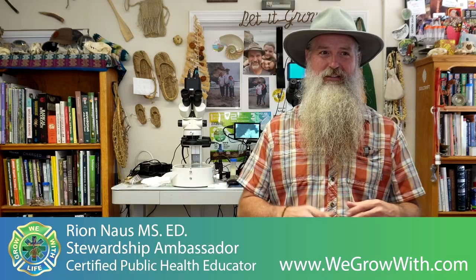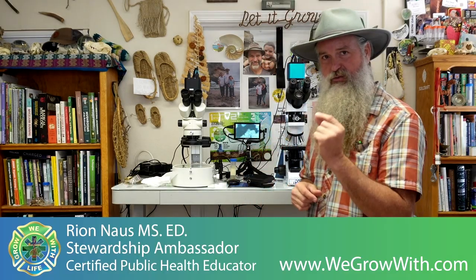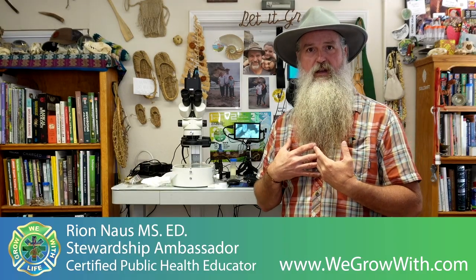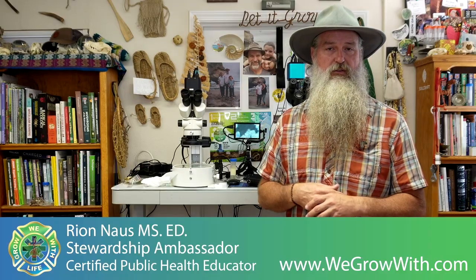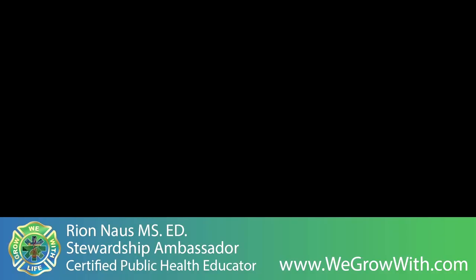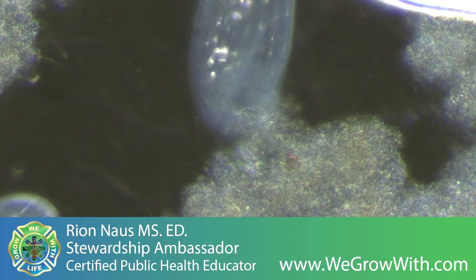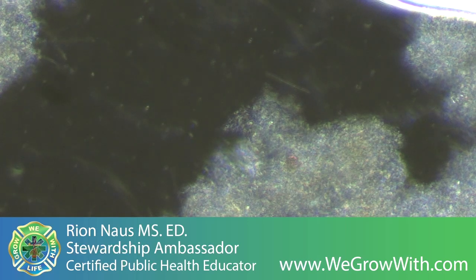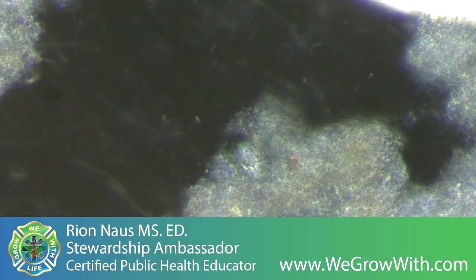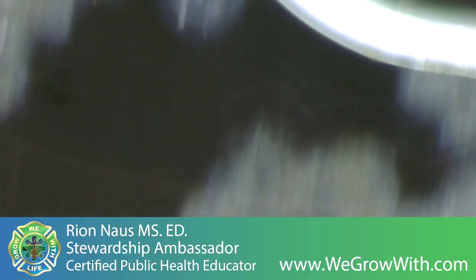And at that point, like these small things that are taking place in a single drop mirror what we experience at our level on our scales. And so this protective state is when they say, all right, I'm not done yet, but I'm going to have to take care of myself for a little bit.